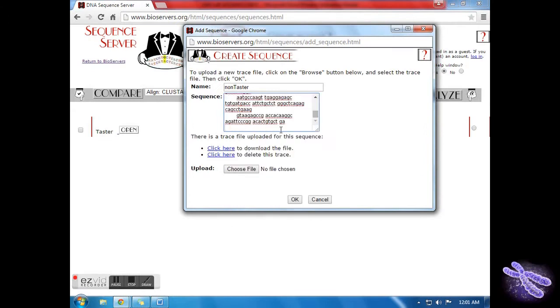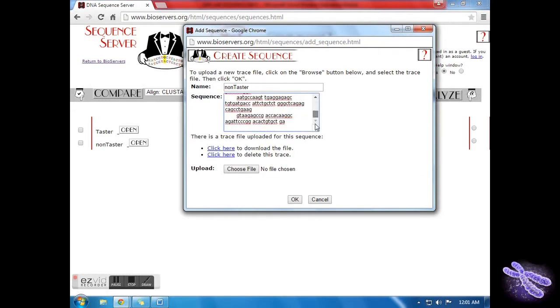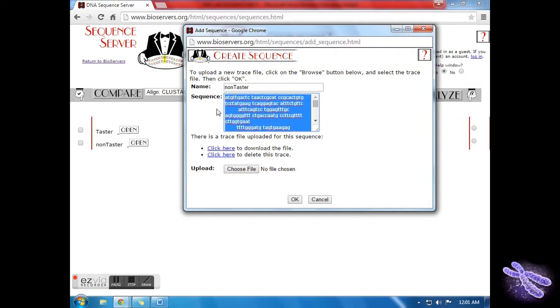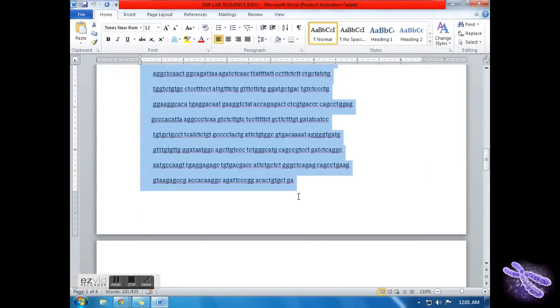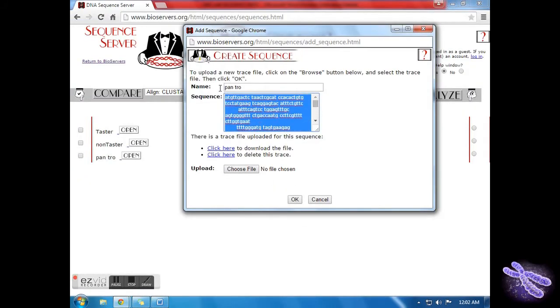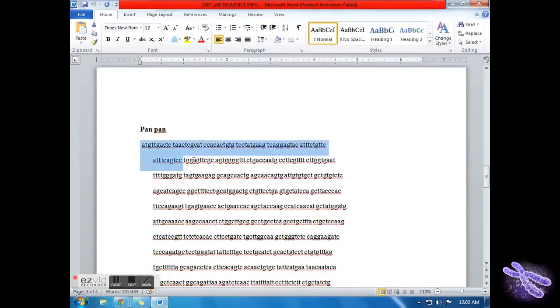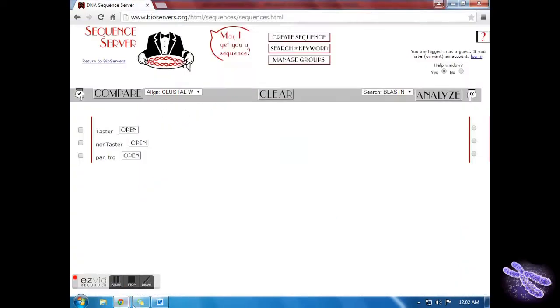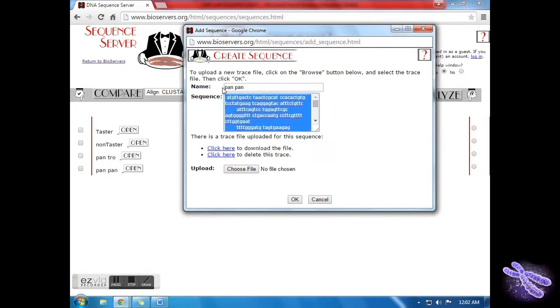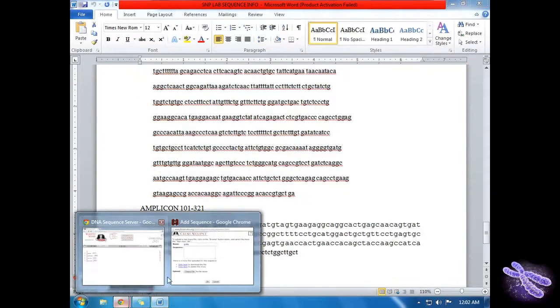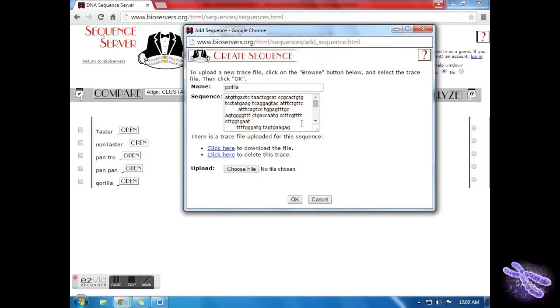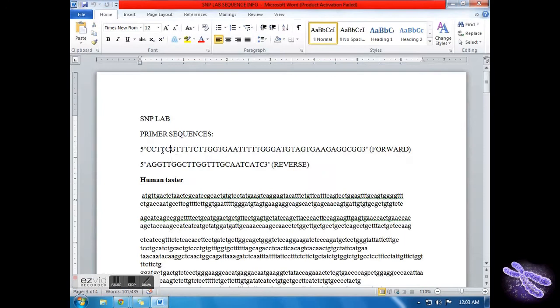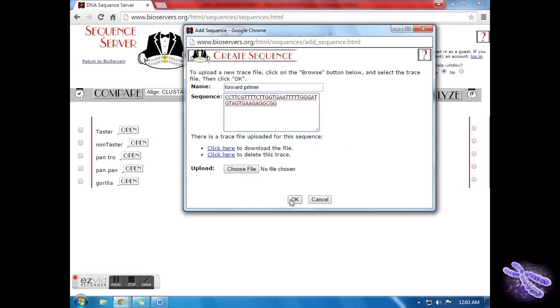Repeat these steps for Pan troglodytes, Pan paniscus, Gorilla, the forward primer, and the amplicon. Once you've finished all seven sequences, you can begin comparing.